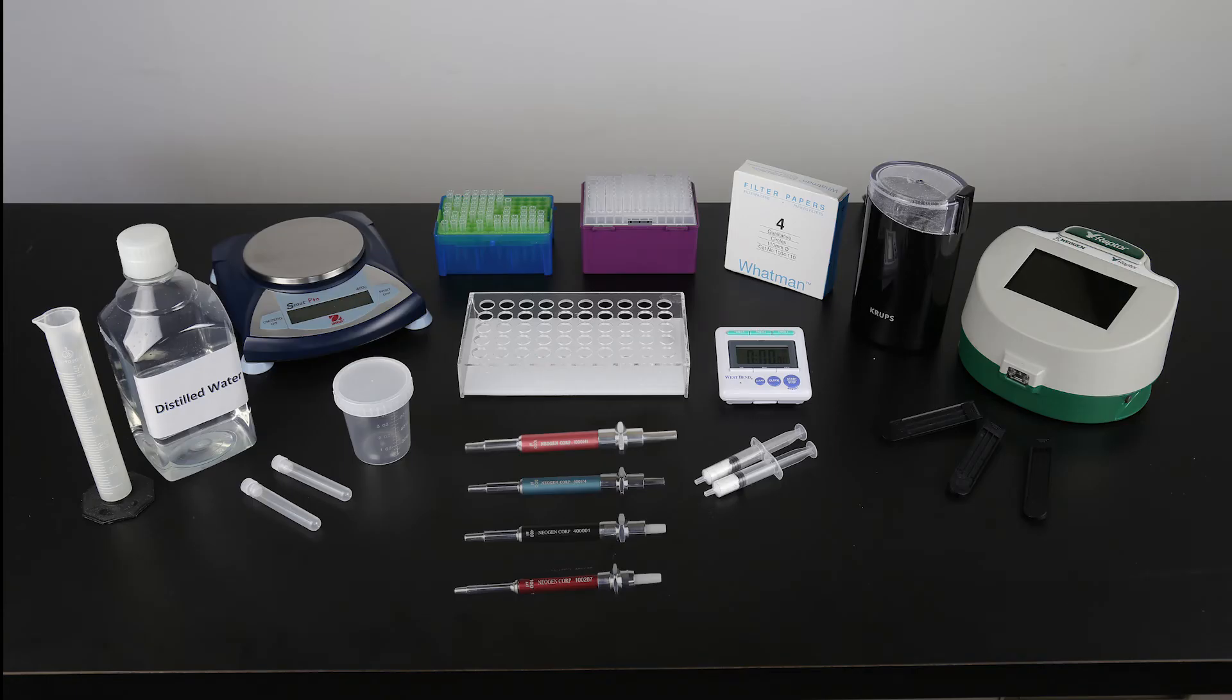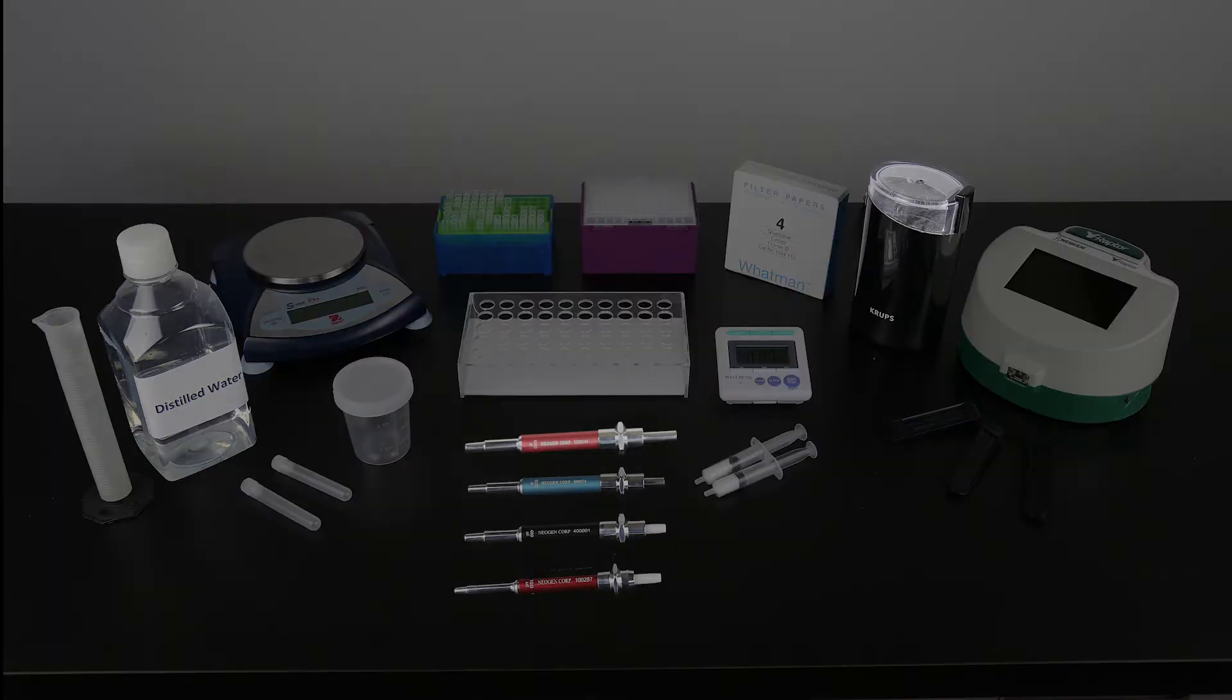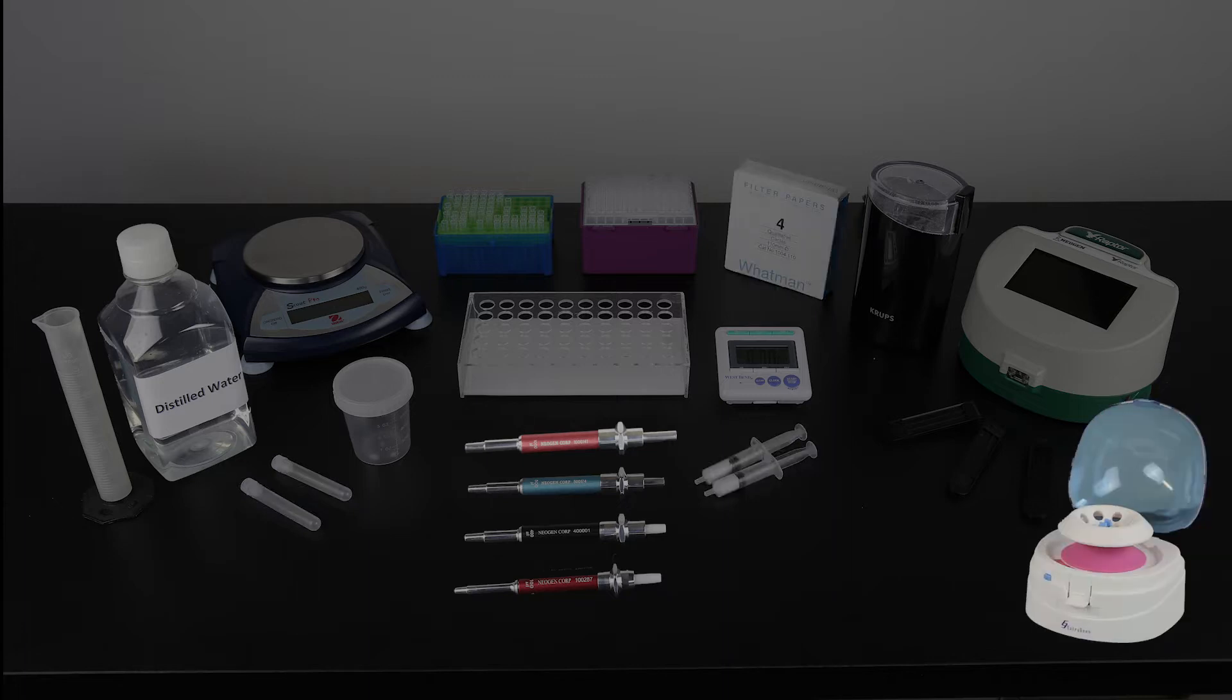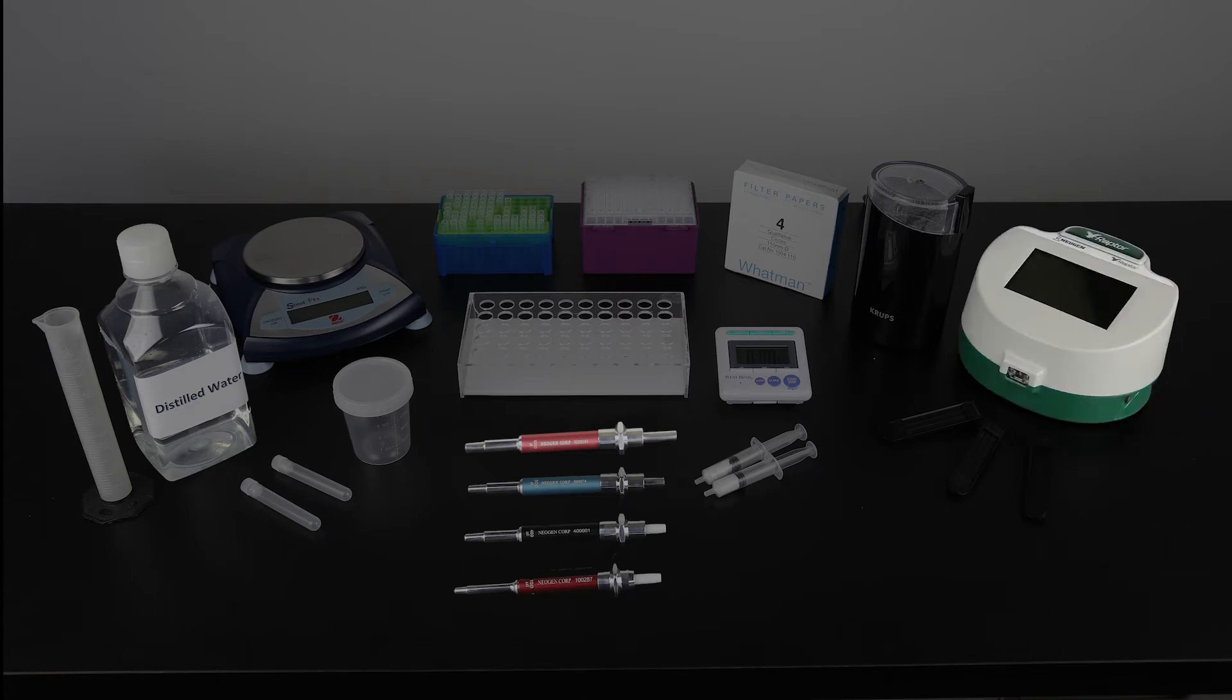To conduct the test, you will also need an Agri-Grind or equivalent grinder, a scale capable of weighing 10 grams accurate plus or minus 0.1 gram, a timer, a Reveal sample cup rack, 50 milliliter graduated cylinder, 65% ethanol solution, a 100 microliter, 400 microliter, and 500 microliter pipetter and tips, sample collection cups and lids, sample collection tubes and caps, filter syringes, Wattman number 4 filter paper or mini centrifuge and tubes, a Raptor integrated analysis system, and Raptor cartridges.